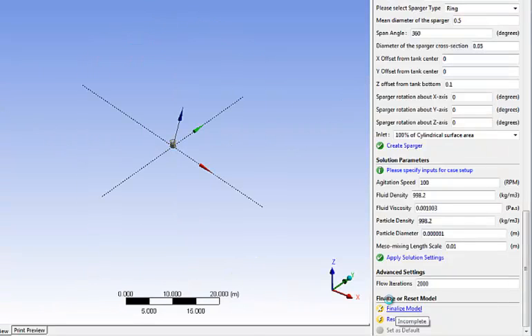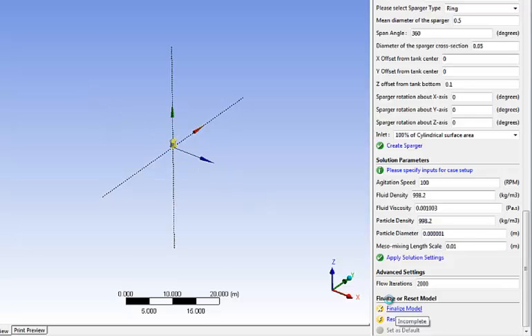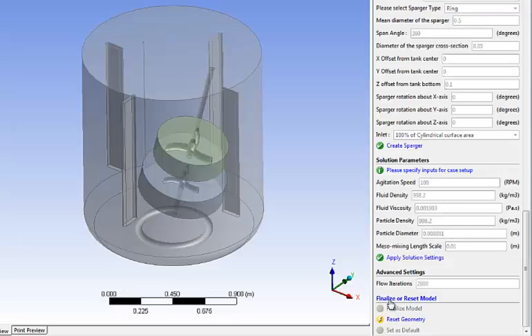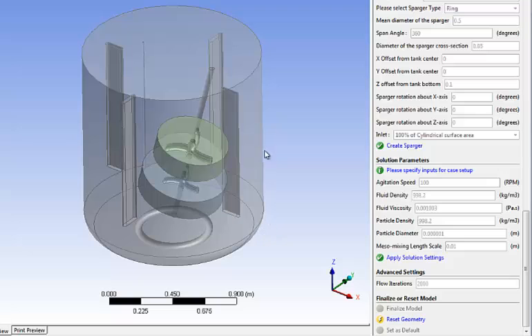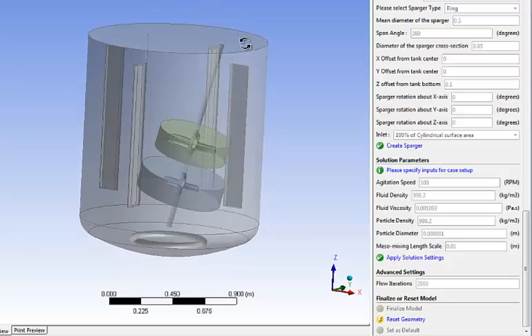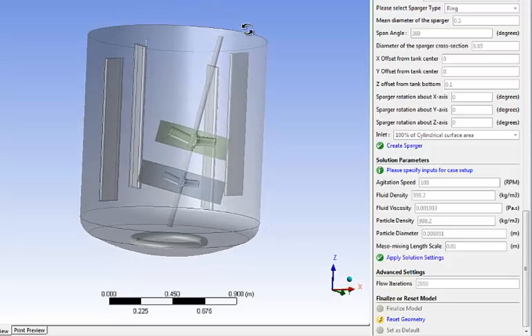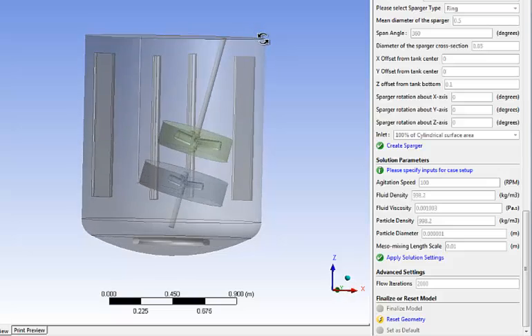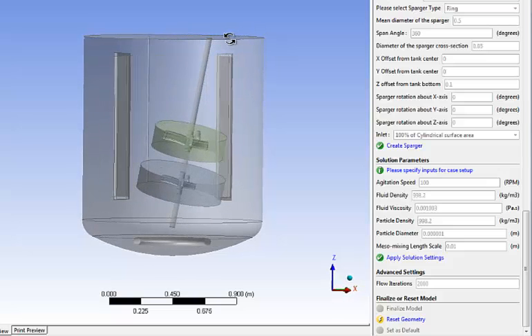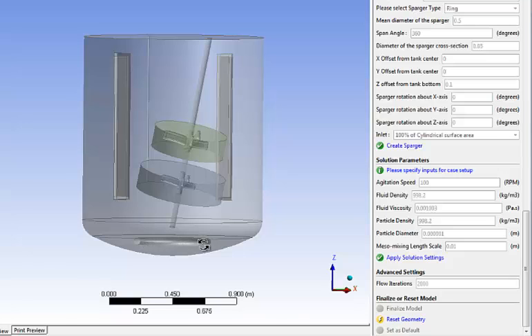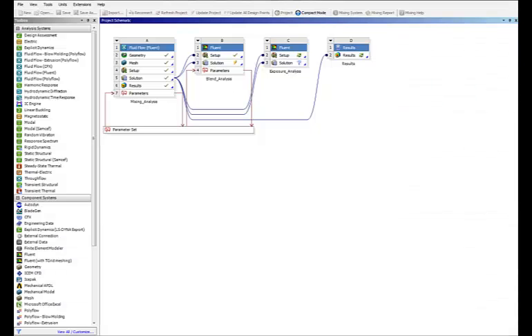And before you even know it, you will be able to see your fluid volume, which is right here. And again, you can see all the details. You still have the baffle, the probe, the shaft, the impellers, the sparger, etc.